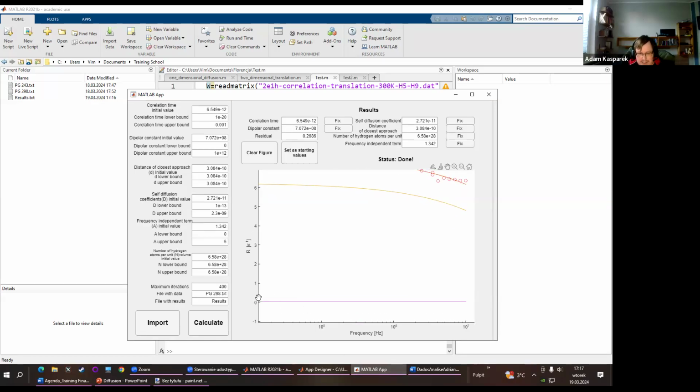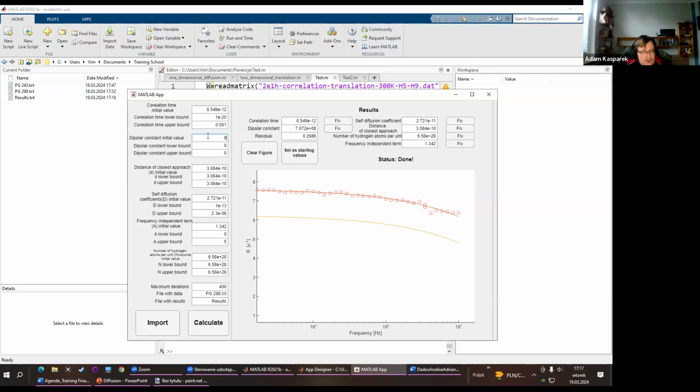If we would enlarge it, we would see how big it is. But it's probably not relevant for this data. So if it is not relevant, the next step is to say it doesn't exist. Let's check whether, if it is so small, we can fit without it.